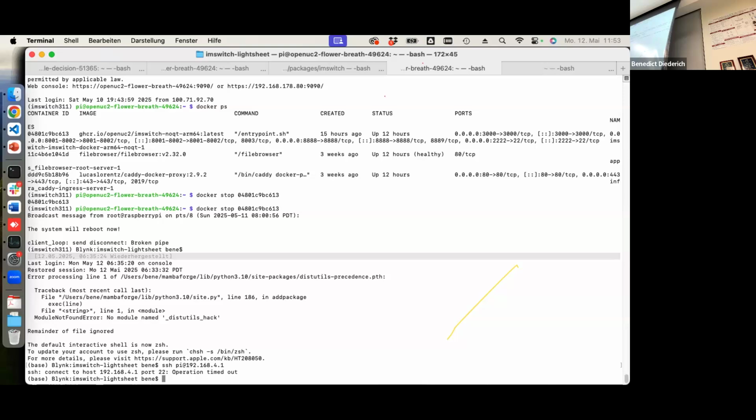Like a transillumination. Well, yeah, this will be. I also have like no experience trying to read. We're working on this afterwards. We'll see. This is what I'm working on. These are some things that are really, like, blue skies, and then we just have like signs of recovery.